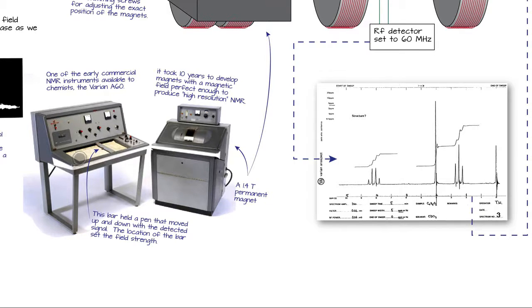Now you have to start at one end and gradually and slowly go across, because it takes time for the signal to be absorbed, and it takes time to emit it. And if you're moving too fast, you'll basically pass through the signal so fast the pen will hardly move. So you have to move that pen basically about a second per hertz of frequency. So if you're sweeping 600 hertz, which would be a typical spectrum here, it would take a 5-minute sweep to get a really good NMR. So it takes some time to do NMR like this. But there's the output you would get.